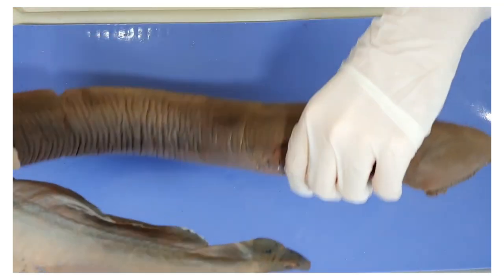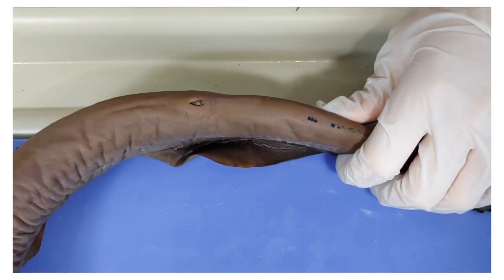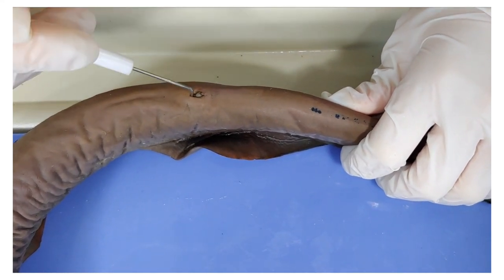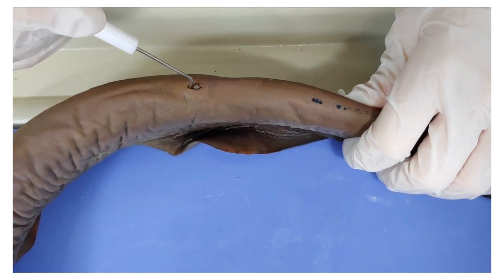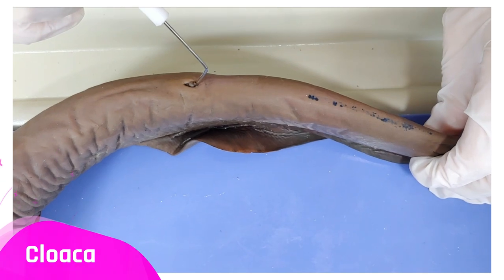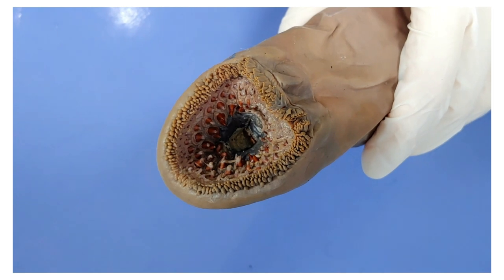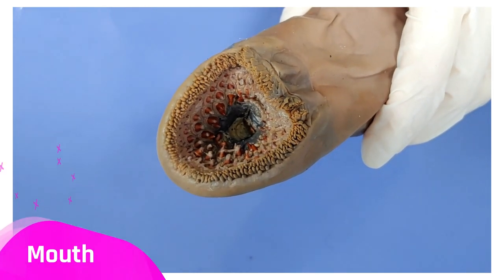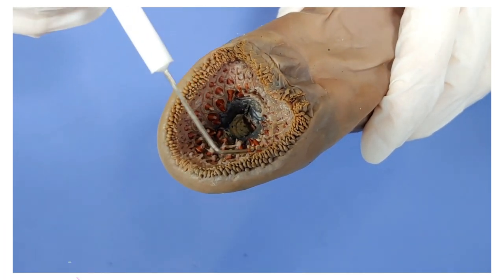Now I'm going to flip the lamprey over. Down towards the tail, you can see two openings. The one closer to the head, the anterior hole, is the anus — the end of the digestive tract. The one closest to the tail is called the cloaca, and it's the common opening for the urinary and the reproductive tract. I know I'm talking around the elephant in the room here, which is this terrifying mouth — I'll talk more about it later when we've opened it up, but you can see there are teeth lining it.